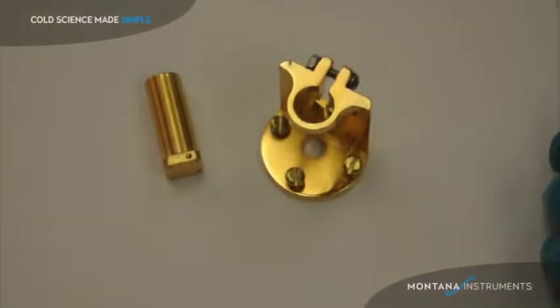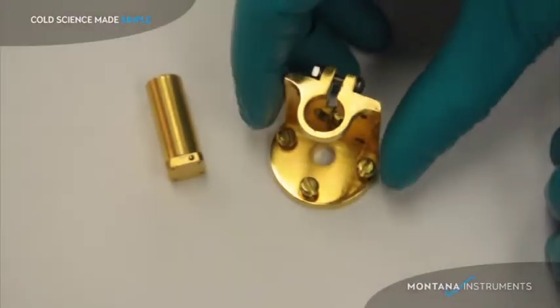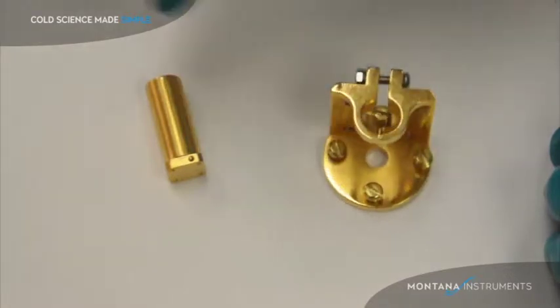I'd like to show you how the sample mount works in the cryo station. The sample mount consists of the grip bracket and the sample post.